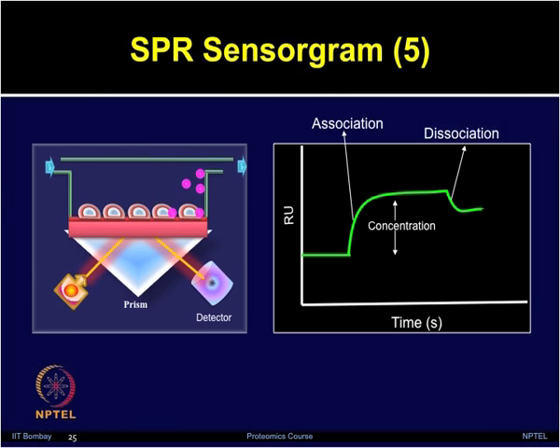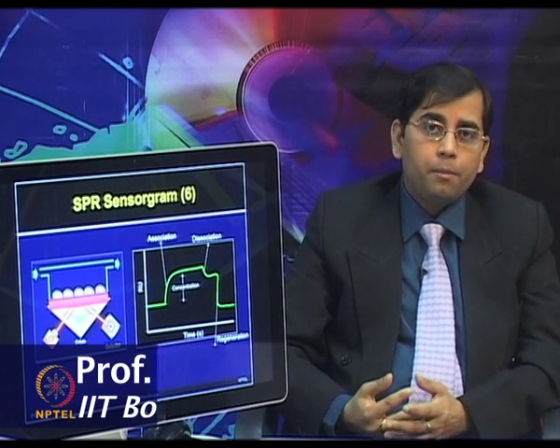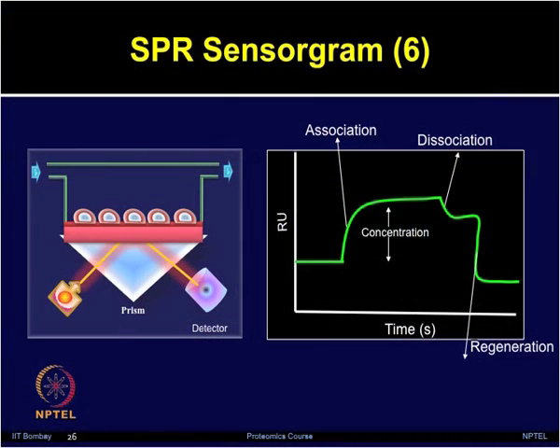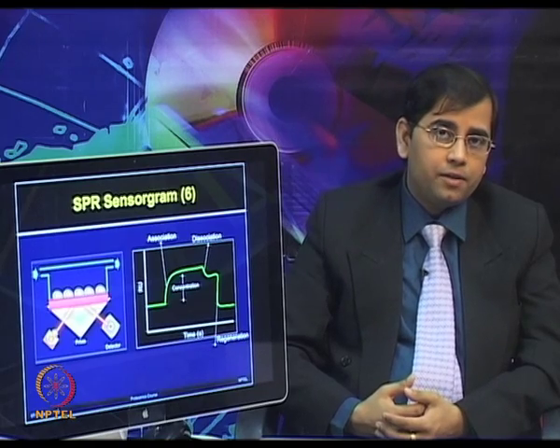The left panel is showing the proteins being dissociated from the bound molecules. After the experiment is completed and the SPR run is finished, the same chip can be reused for further experiments, but one needs to apply a mild acid treatment and further washing with the running buffer, and this process of making use of the same chip for further experiments is known as regeneration.